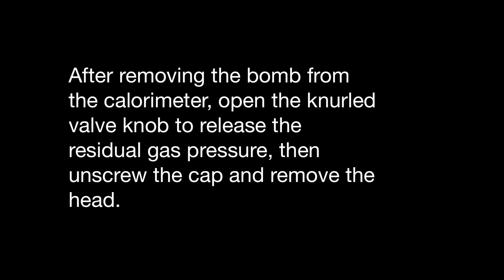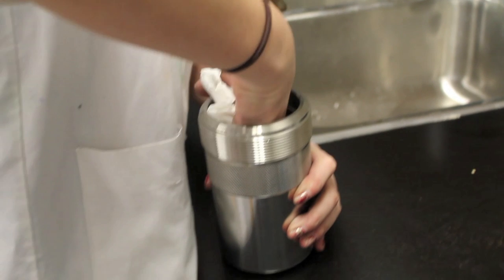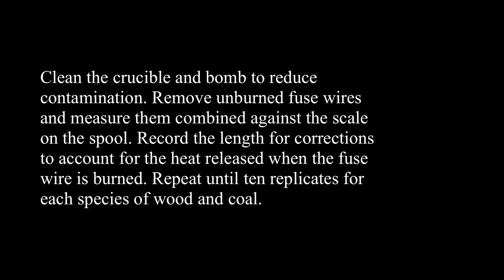After removing the bomb from the calorimeter, open the knurled valve knob to release the residual gas pressure. Then unscrew the cap and remove the head. Clean the crucible and bomb to reduce contamination. Remove unburned fuse wires and measure them combined against the scale on the spool. Record the length for corrections to account for the heat released when the fuse wire is burned.